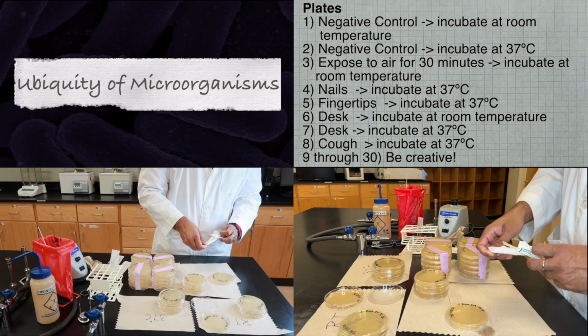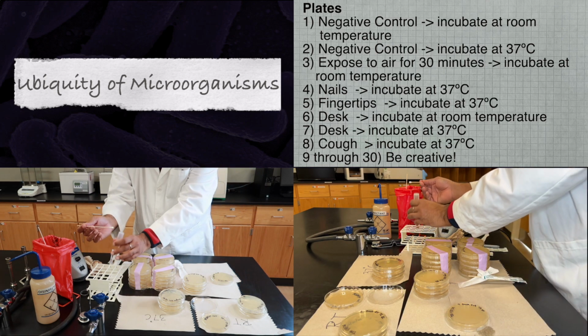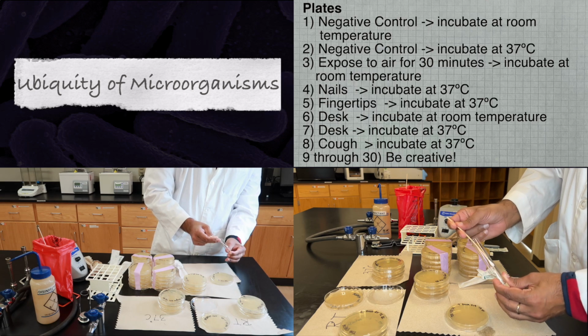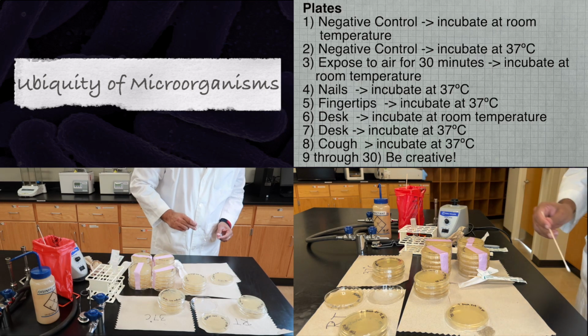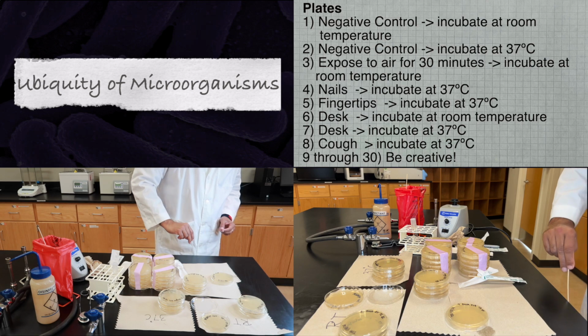For plate number 7, again, get a new sterile cotton swab. Dip that sterile cotton swab into your sterile water. Wipe the cotton swab across a different side of your lab table.